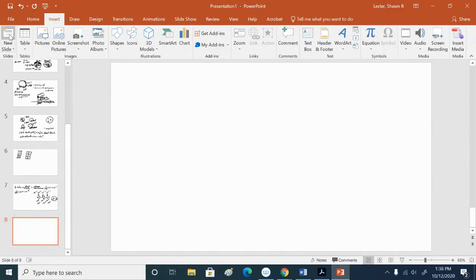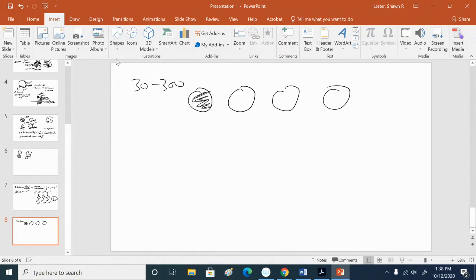So when we're counting plates, what's our range of colonies? 30 to 300. Right. So, what's TNTC? Too numerous to count. Right, too numerous to count.